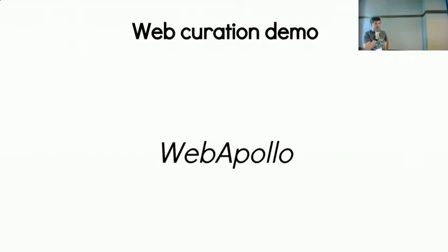It's using Docker Compose to build a Galaxy Docker image, which is Apollo, which runs in a Tomcat Java server, which runs using the Postgres database. You can use other databases, but that's the one that it supports and works well with.